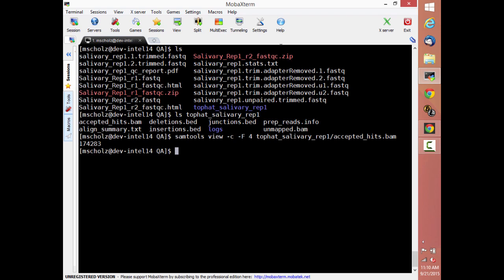I've done this before. So how many reads did we start with? About 88,000 times 2, right? That was what we had after trimming. So we had about 176,000 reads. We have 174,000 of them aligning to the reference genome. Is that good? It's great. Should we be concerned? Is it too many?